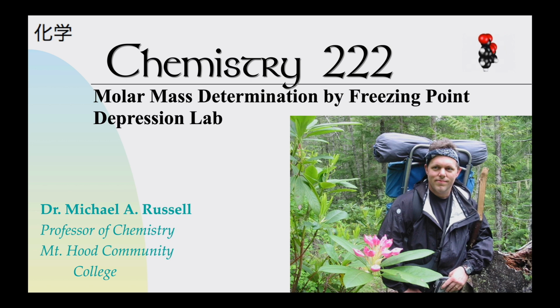Another lab with way too many syllables, probably for its own good. So let's call this the Freezing Point Lab. I think that'll be a little bit better. This lab is pretty cool for chemists.